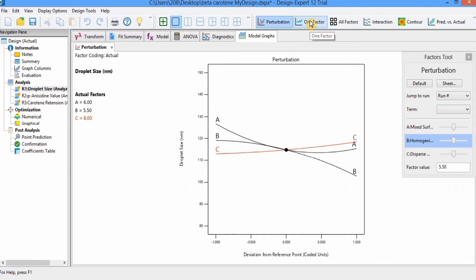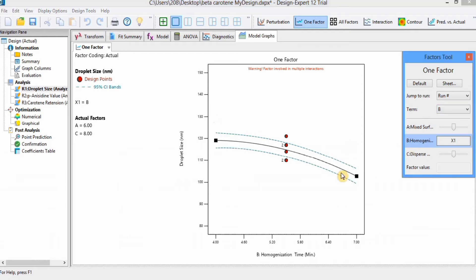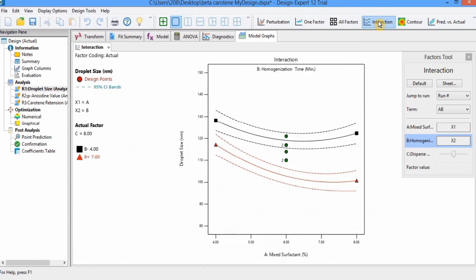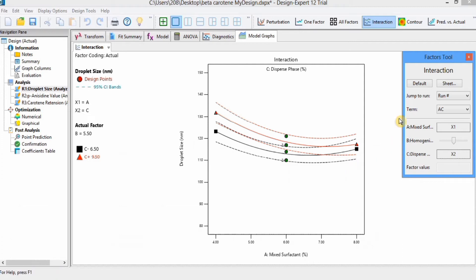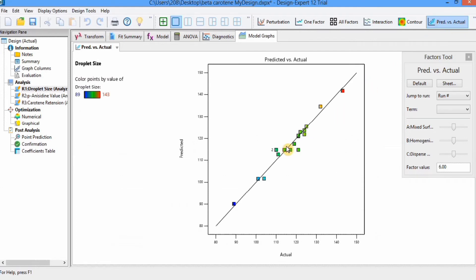If you click on One Factor, the effect of an individual factor on the response variable appears here. You can change the term to A, B, or C and the graph will update. If you want individual graphs of each factor, those will appear here. For interactions, if no interaction appears, change the term to AC and you can see some interaction appearing. You can make different graphs by changing these terms. There is also a Predicted versus Actual graph where values should be linearly arranged, and in our graph they already are.